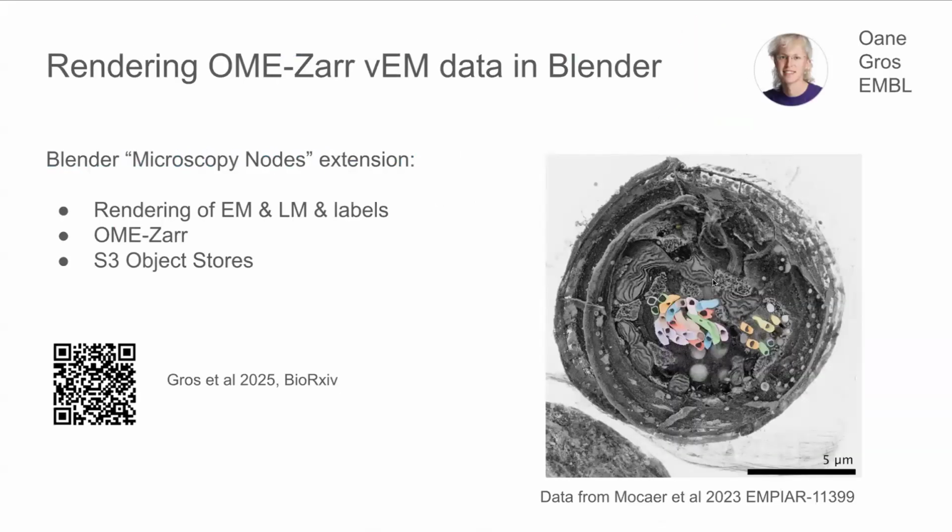Then another thing, so OME-Zarr support is really increasing. So for those of you that like Blender to make beautiful renderings, there's good news. So you can check out this publication here and learn how to make beautiful correlative image renderings of OME-Zarr data in Blender.